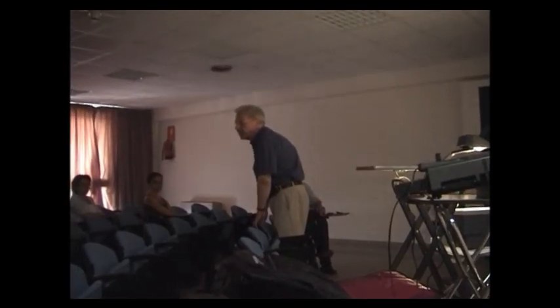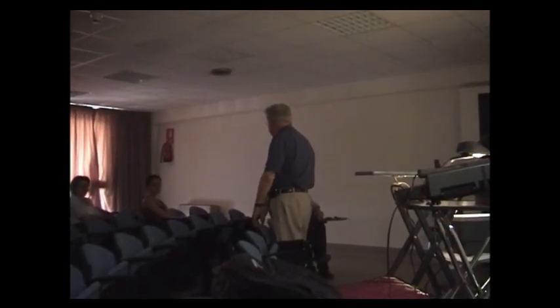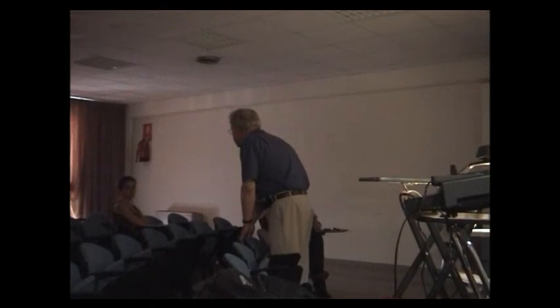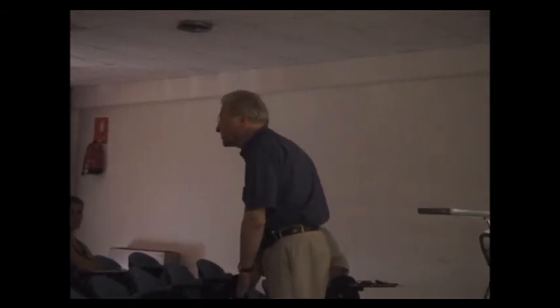We were asked to solve a problem of a fake gold artifact from Byzantine times, which was purchased by the curator of the Museum of Berlin, and in which several elemental contributions seem to be of a very recent period.